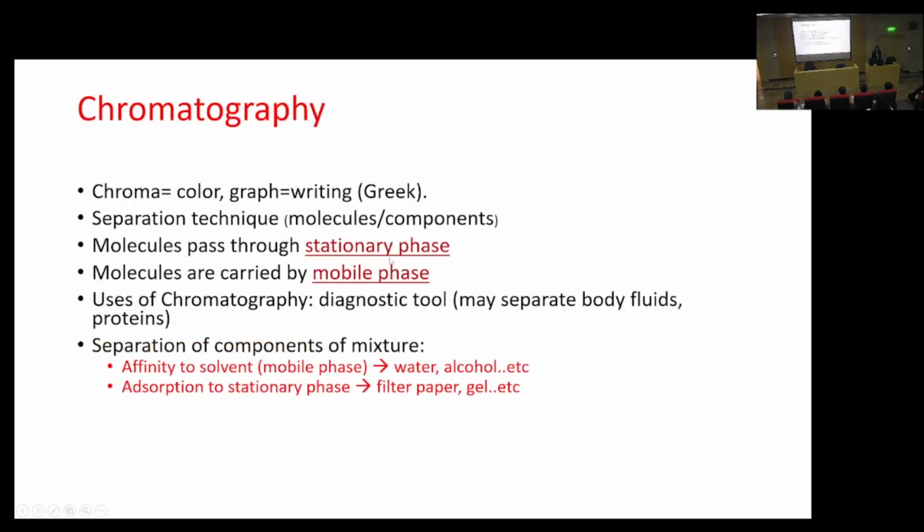Essentially the blue dye is the original dye, and in the presence of the paper and that liquid, that solvent, somehow that dye was separated into its original mixture or components. That tells you that probably the blue ink is really a mixture of other dyes. Maybe it's a mixture of green and pink combined together. So in a very basic way, this is what chromatography means.